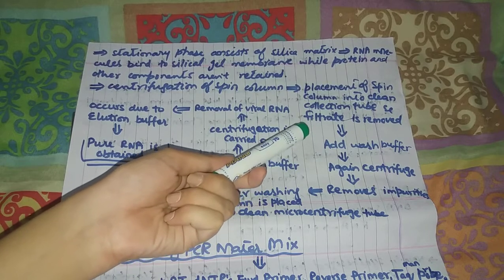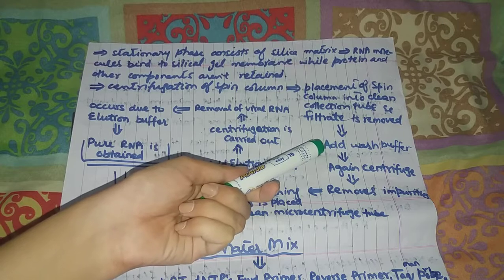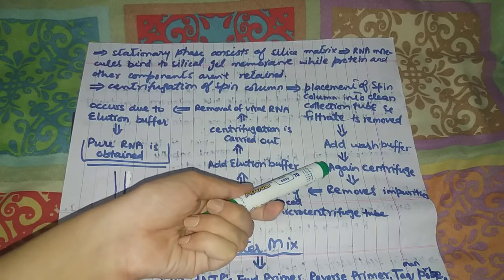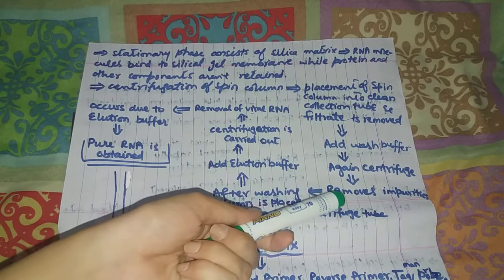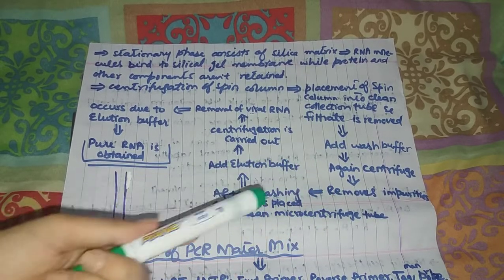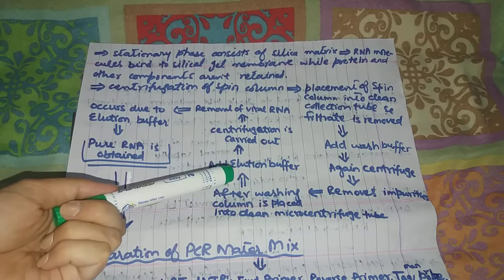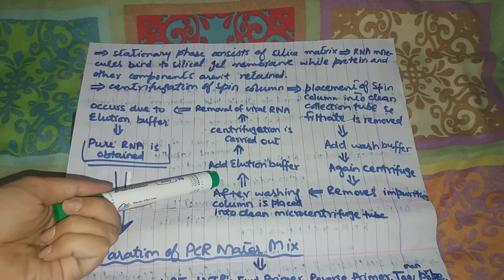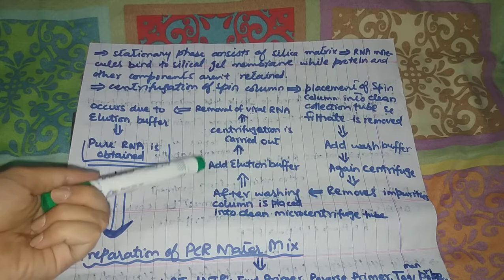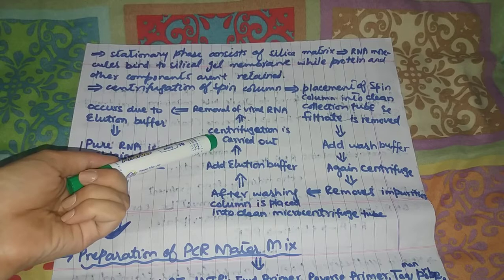After filtrate removal, we add washing buffer, and then we go for centrifugation again. As a result of that centrifugation, the impurities get removed. After washing, the column is placed into a clean microcentrifuge tube. Then we add elution buffer, and after addition of this elution buffer, we go for centrifugation.